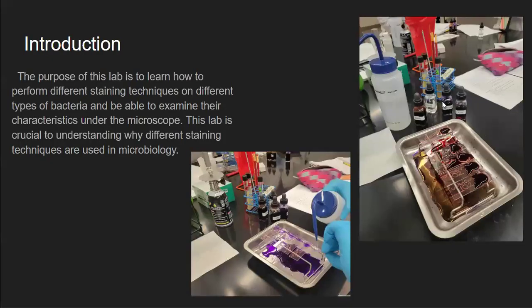Introduction. The purpose of this lab is to learn how to perform different staining techniques on different types of bacteria and be able to examine their characteristics under the microscope. This lab is crucial to understanding why different staining techniques are used in microbiology.